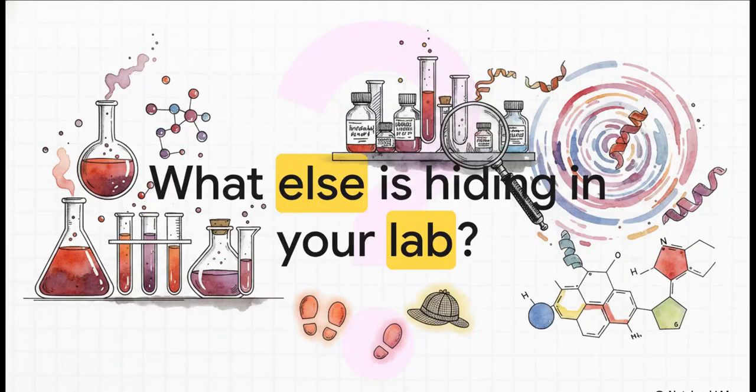So we've seen how utilizing specific chemical reagents and just a little bit of heat can completely unmask the invisible, turning clear solutions into vibrant reds, oranges, and purples to identify the fundamental proteins and amino acids that make up life. But honestly, this just scratches the surface of laboratory identification.